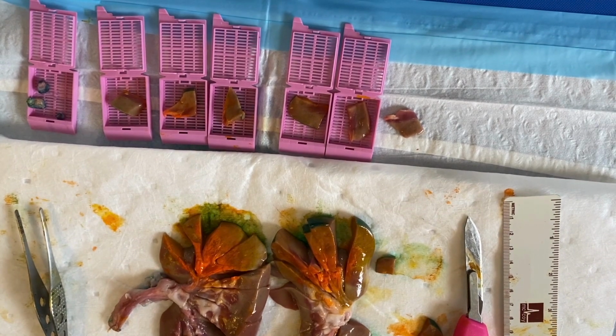Okay, and that is how you prosect a kidney. Remember the friable nature of renal cell carcinoma. Remember to allow your specimen to fix. And we'll discuss other questions in our laboratory session.